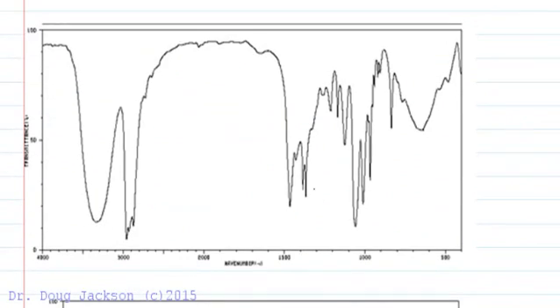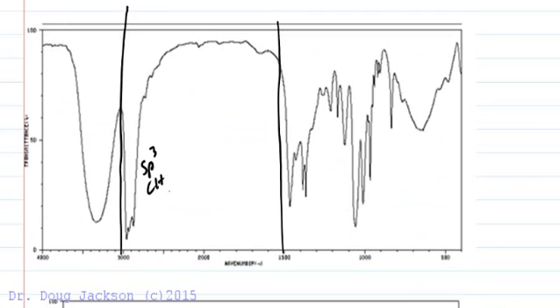We're going to draw our line at 1500 wave numbers for this spectrum and then 3000. So the only thing we see here is SP3 CH dog ear to the right of 3000 and then we see the OH stretch. We don't see anything else. You know a little line here can indicate noise on the baseline versus overtones but we have nothing else that we can identify. So this is an alcohol.